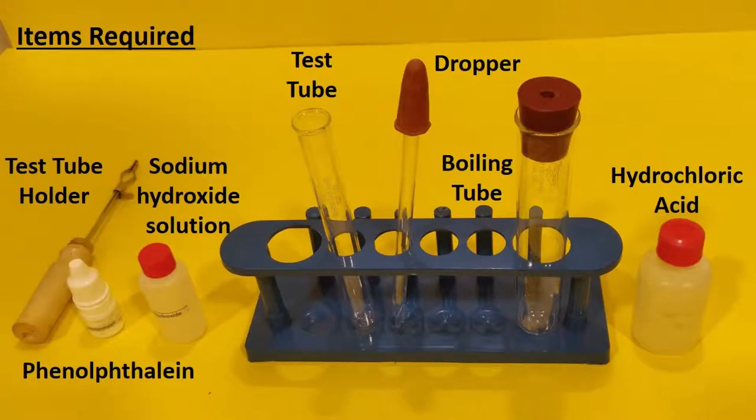For this experiment, we will need a test tube and test tube holder, phenolphthalein indicator, sodium hydroxide solution, hydrochloric acid, a dropper, and a boiling tube. Additionally, we will also require pH paper.